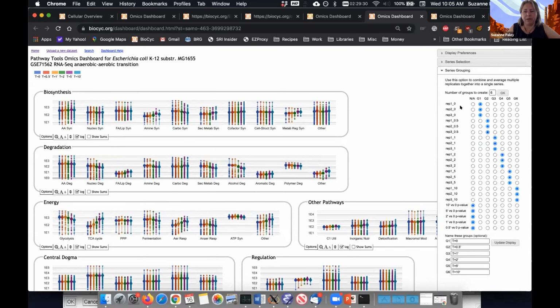There are 3 replicates for every time point, so I was able to tell it to create groups, and it would average these replicates. I tell it which sets of input data columns should be averaged together into which group. I can name these groups, which I've done. And this data set also contains additional significance columns because in this case, a significance analysis was run.